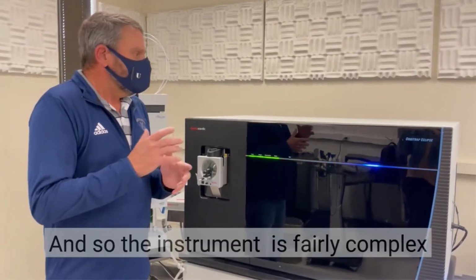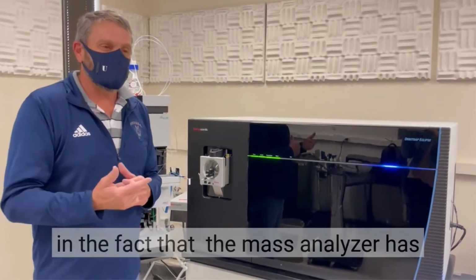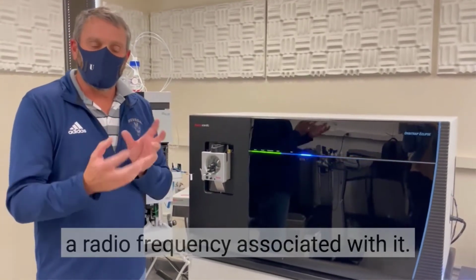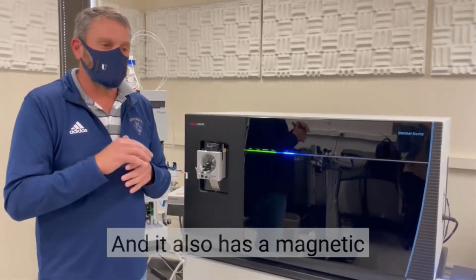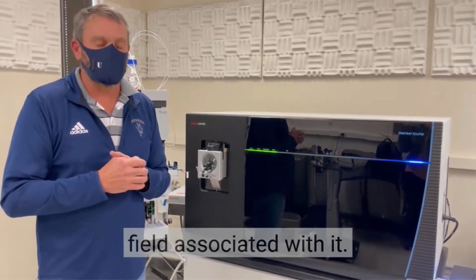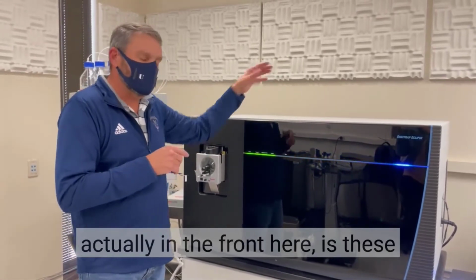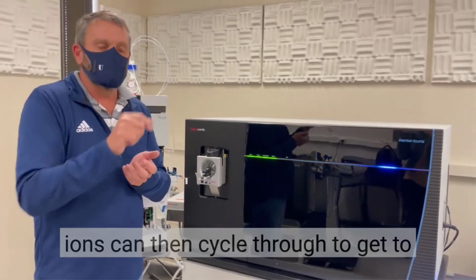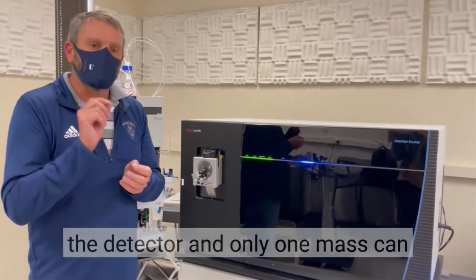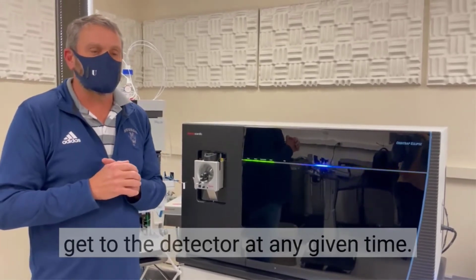The instrument is fairly complex in that the mass analyzer has a radio frequency and a magnetic field associated with it. In this quadrupole in front here, the ions cycle through to get to the detector, and only one mass can get through to the detector at any given time.